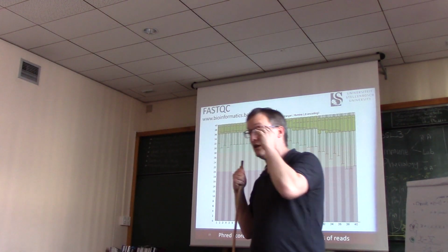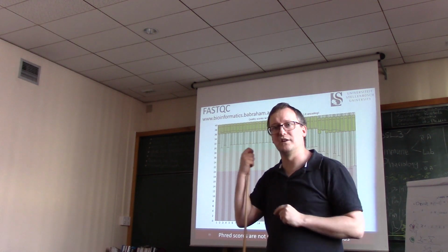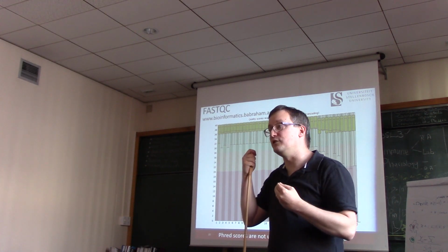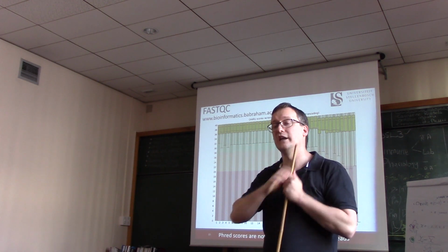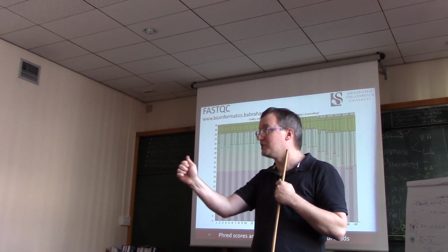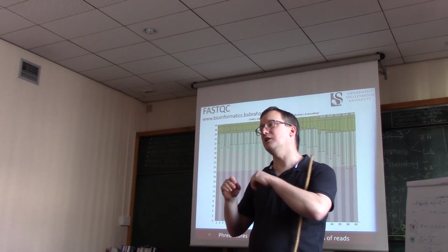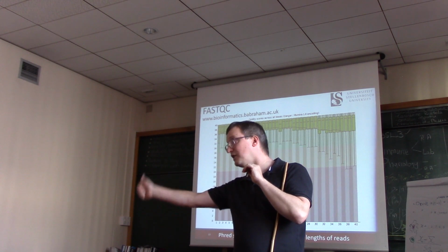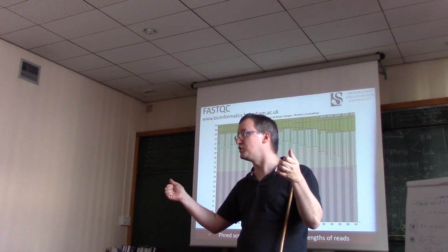Okay. Now, one of the things that we frequently want to do is evaluate whether the money we invested in our sequencing experiment was worth anything. So one of the things that we often do is evaluate the quality scores that occur across these sequences. Now remember, we're not making a quality score for the whole read. Our quality score is built around this base call, this particular letter in the sequence. So you can imagine, as you saw in the electropherogram a moment ago, that the sequence calls at the very beginning of the sequence and the ones at the very end of the sequence may be questionable.